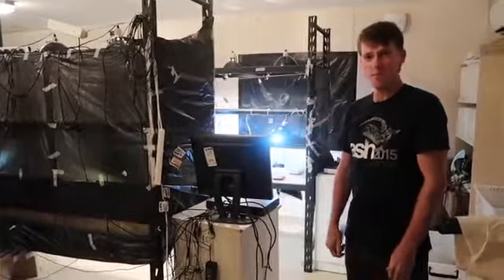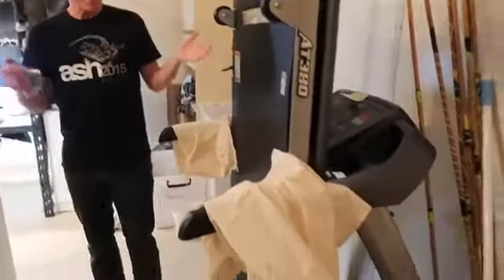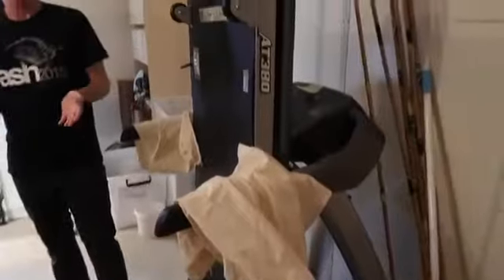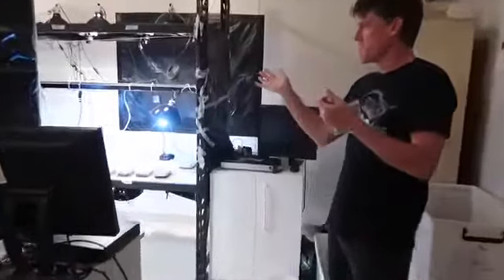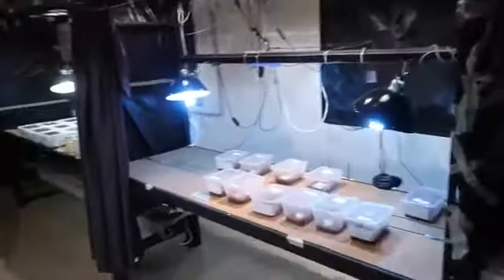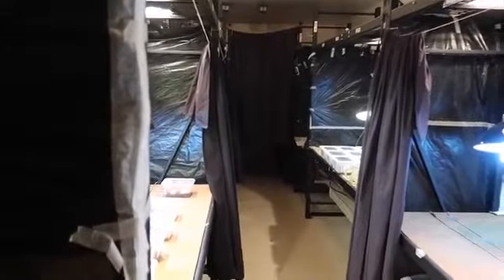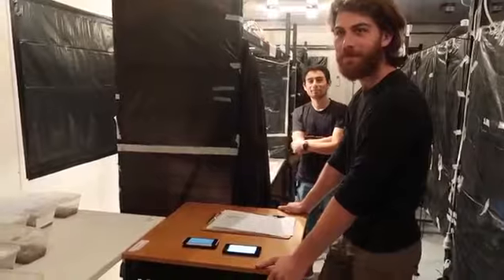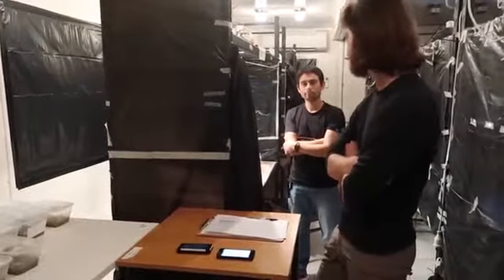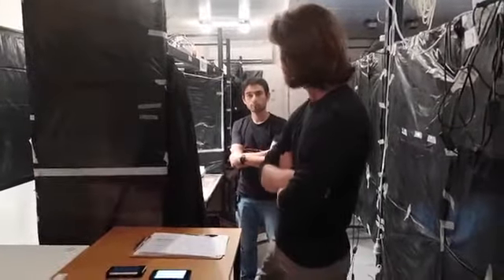And then we also do some performance work. We have this human treadmill here, which has a special setup that goes on top, and we can measure endurance in lizards. If you have a little look around, you'll see that we've got lots of containers containing various lizards. For example, Ivan is doing his PhD on how global warming impacts behavior and how it affects reproductive mode, and Victorian is helping him with some of this work. So maybe Ivan can tell you about what he's up to.